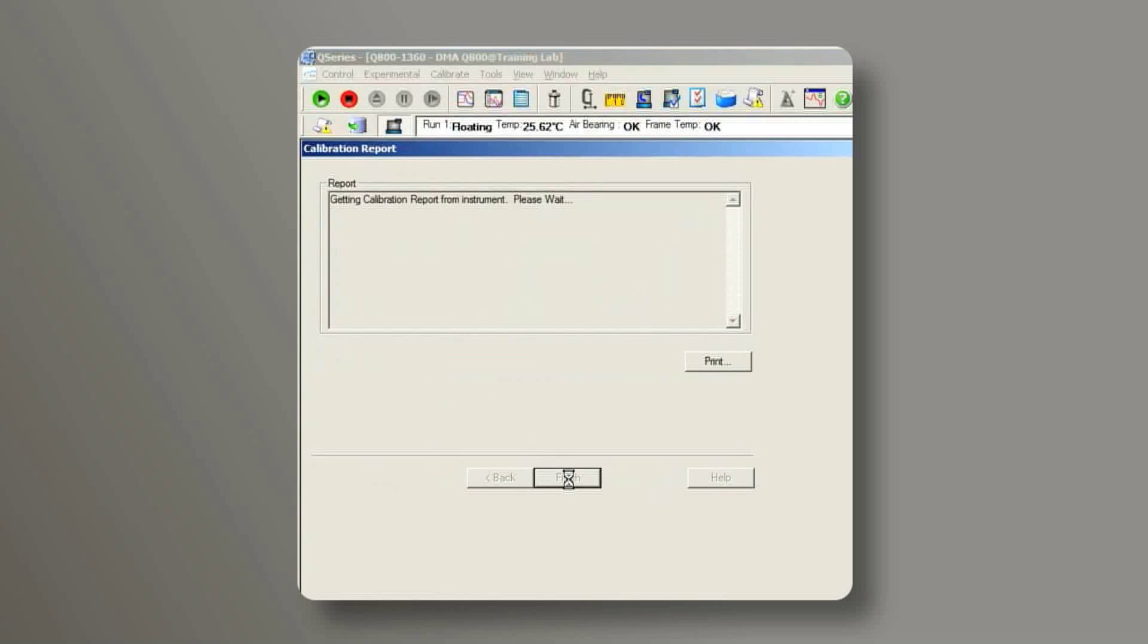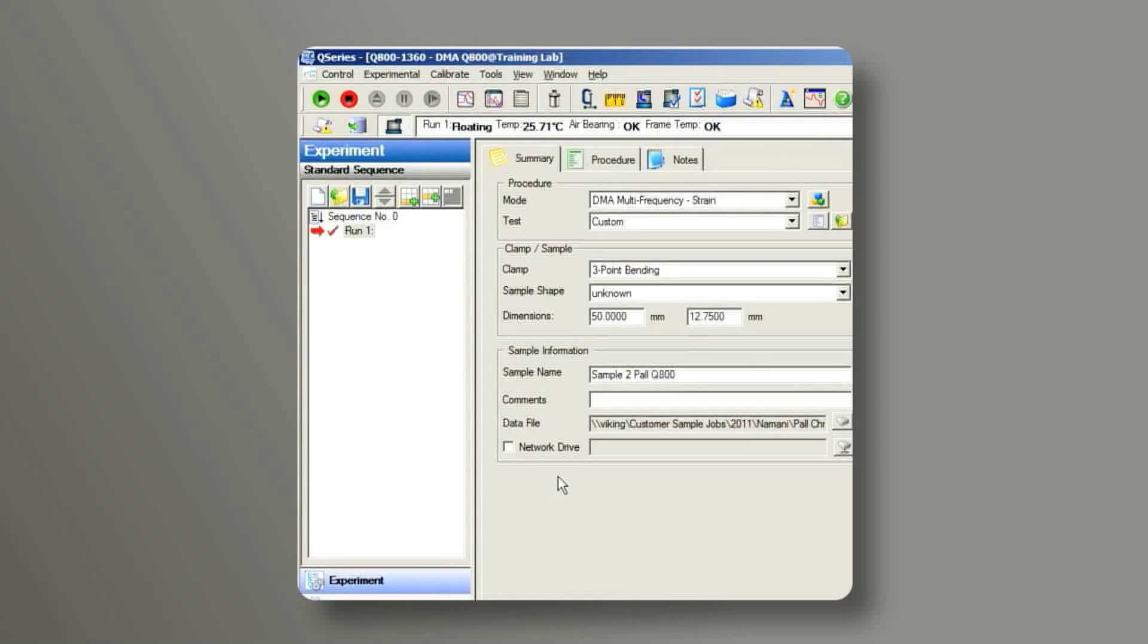After the calibration, check the report. Make sure the clamp compliance value is lower than the maximum value shown on the right side of the screen. You have now finished the 3-Point Bending Clamp calibration.